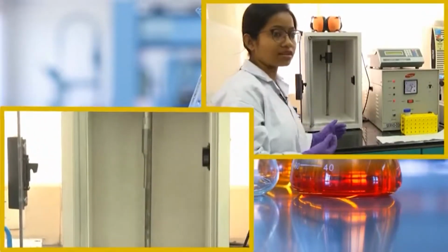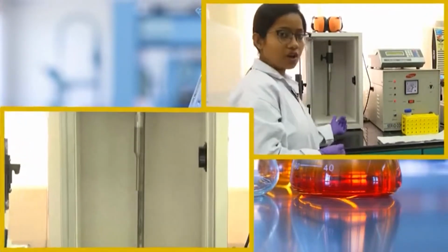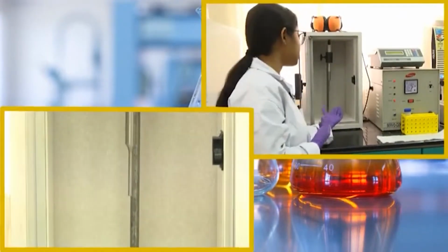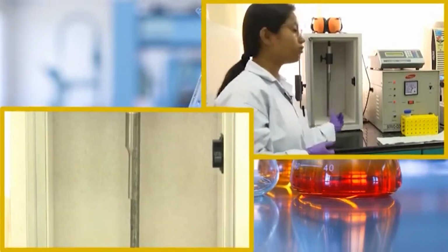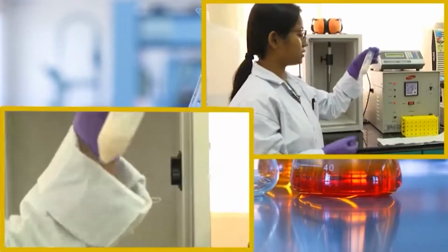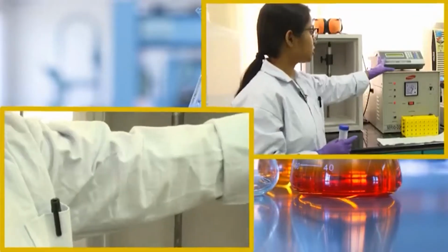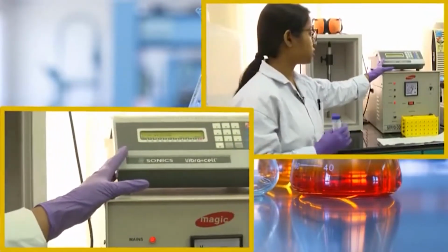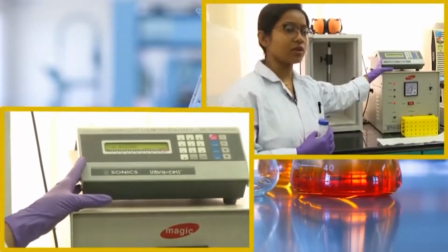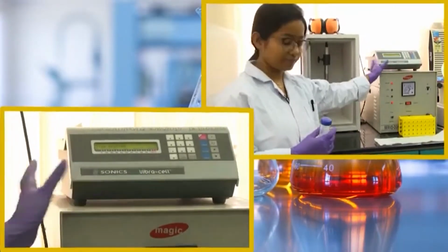If you have a smaller sample volume like 500 microliters or 1 ml, you can change to a smaller probe, or if you have a larger volume like 100 ml or 200 ml, then you can choose a bigger probe than this. This probe is good for around 5 ml to 50 ml of sample. As we have around 10 ml of sample, we are using this medium-size probe. Also, this particular machine can generate a particular sound wave, so the machine's capacity also differs. Based on your requirement, you might have different machines, a smaller one or a bigger one.